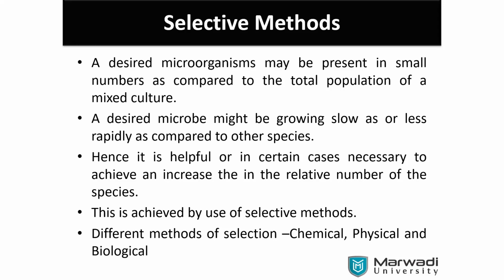What will you get from the marine water? Marine water will be salty, yes. So that is a salt utilizer. We are not going to say degrader, salt utilizer. So halophiles, yeah, you can keep here. Yes, very good. After a week, we are going to have lots of contamination even on the good plates.